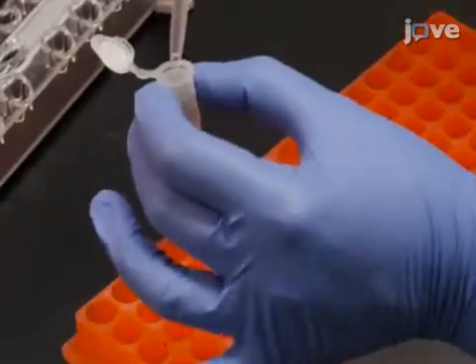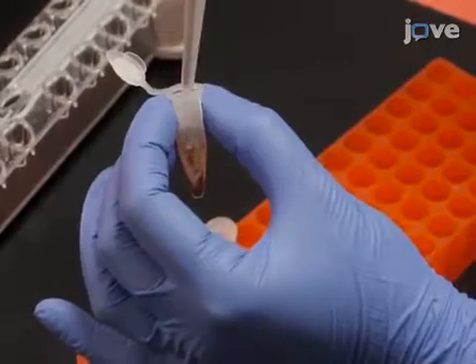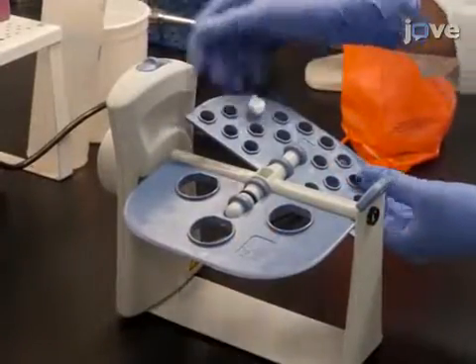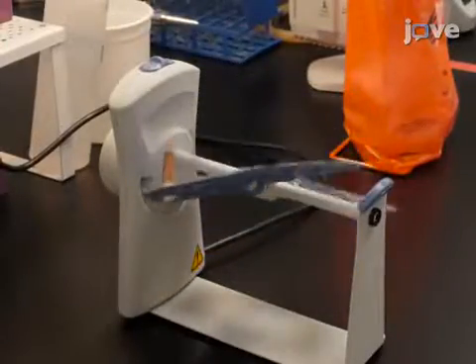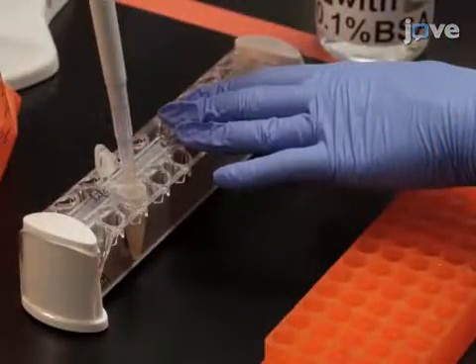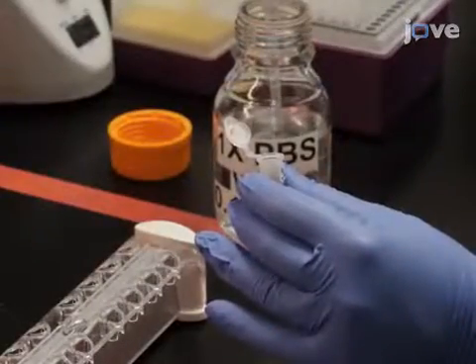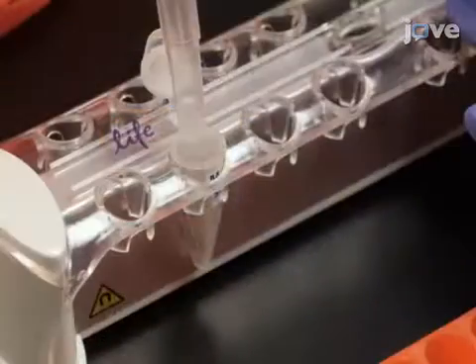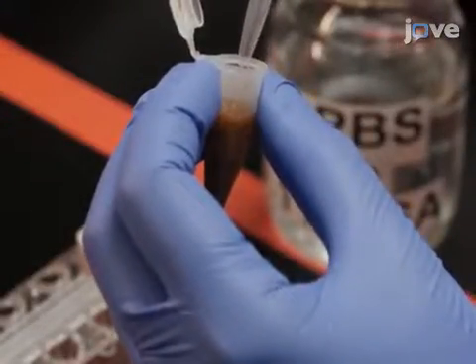Add 1 milliliter of lysate containing the biotinylated antigen to the beads and incubate at room temperature for 30 minutes while gently rotating. Following the incubation, wash the beads 5 times using PBS with 0.1% BSA, then re-suspend the beads in PBS with 0.1% BSA.